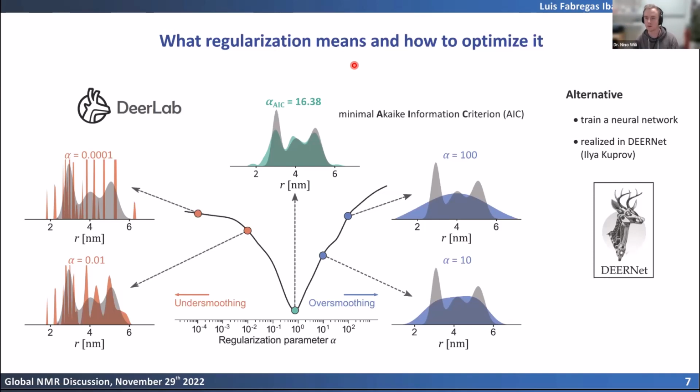Okay. The audience seems to be a little bit shy today, but I still have one more that may make sense. So work-wise, what do you say is time limiting at the moment? Is it still the biochemistry, or is it the EPR? I think the wet lab is limiting. So there are strange dreams to say, okay, maybe we could have robots that make the protein expression and the spin labeling. But from my experience, this is not realistic in the near future.